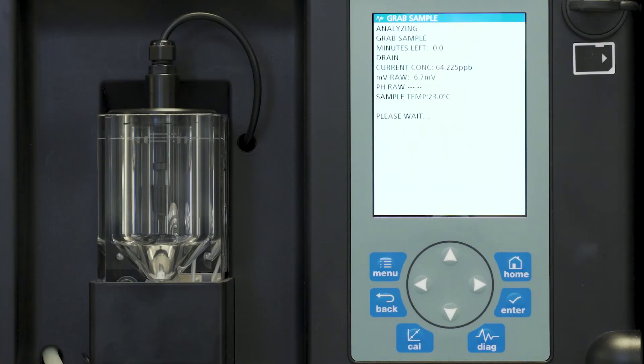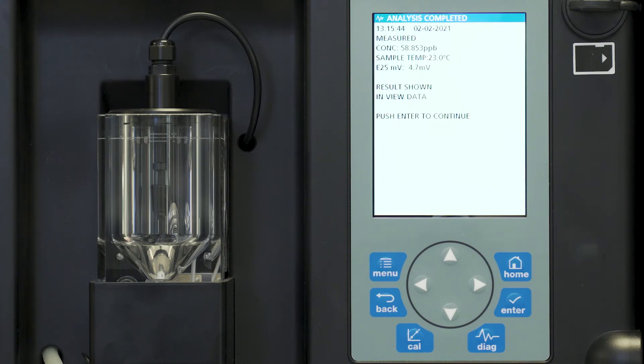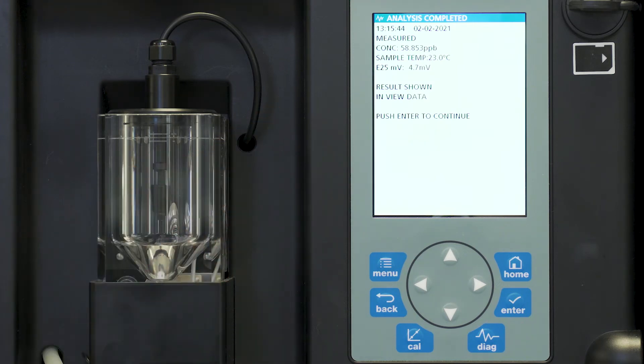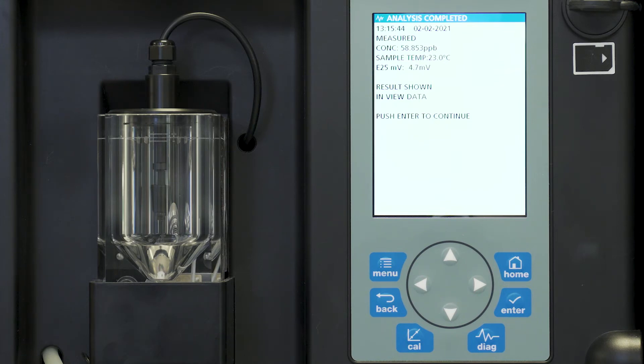So we're coming down to the end of our measurement. The measurement has now been finished and you see that we're measuring about 58.8 parts per billion sodium. It also has maintained what our sample temperature and our millivolt reading is.